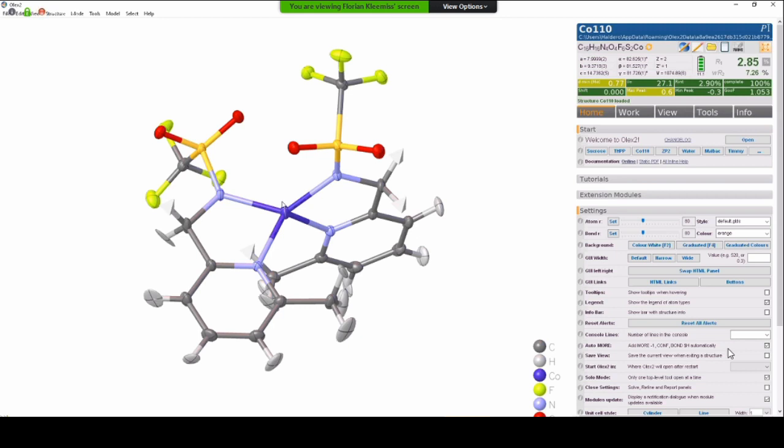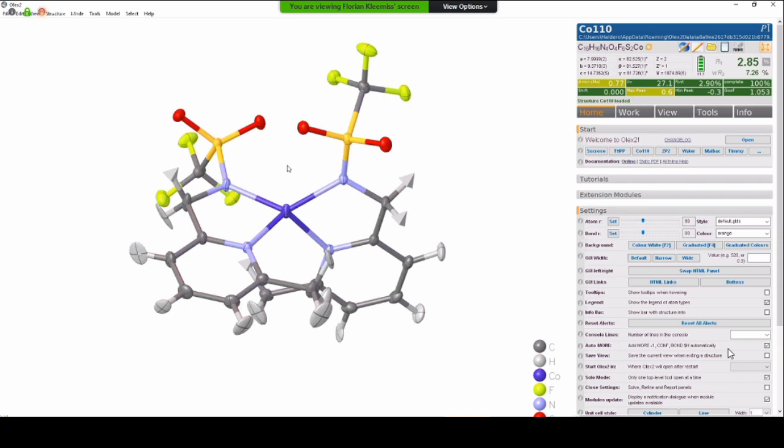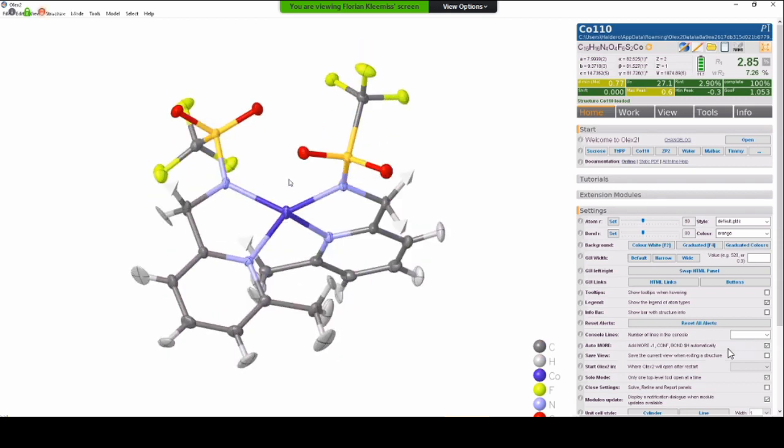And I know that in tetrahedral complexes, usually the high spin form is there. I know that these 3 electrons would all have the same spin, or at least not be paired. Then I can tell the software that this will be a multiplicity of 4.